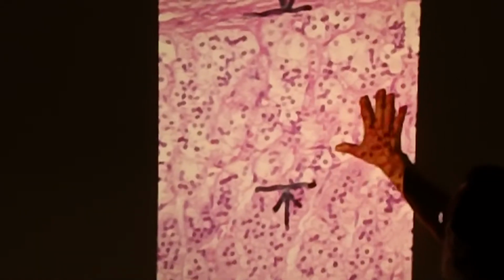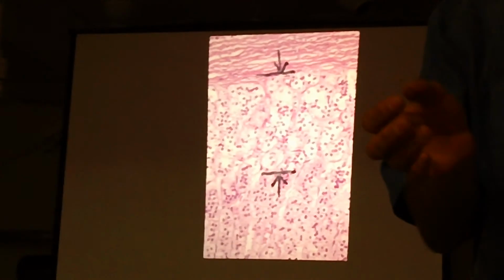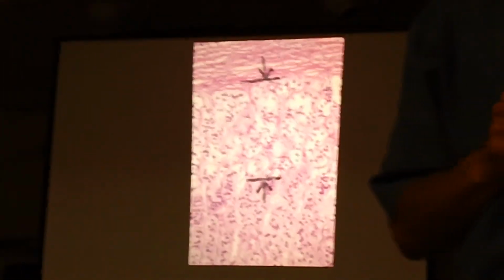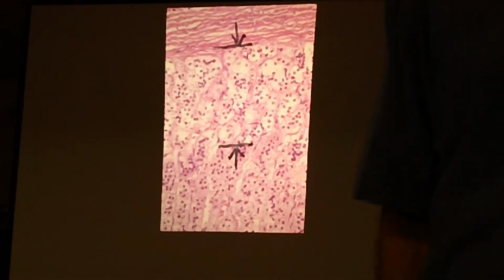Higher power showing the capsule up here, and between the arrows, circular glomeruli or clusters of cells. Here you can see nicely the vasculature which drains down into the medulla. So that's it. Remember, with respect to the dreaded four: ducts or not, serous acini only, mucoserous acini, islets, and oxyphil cells. Those four or five characteristics should help you distinguish.